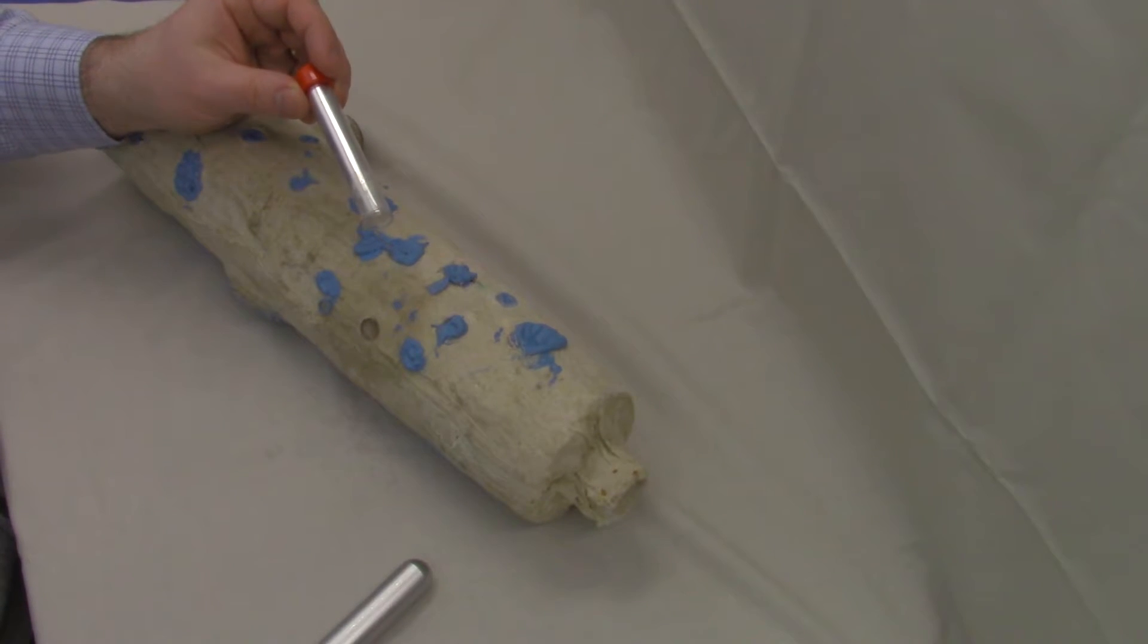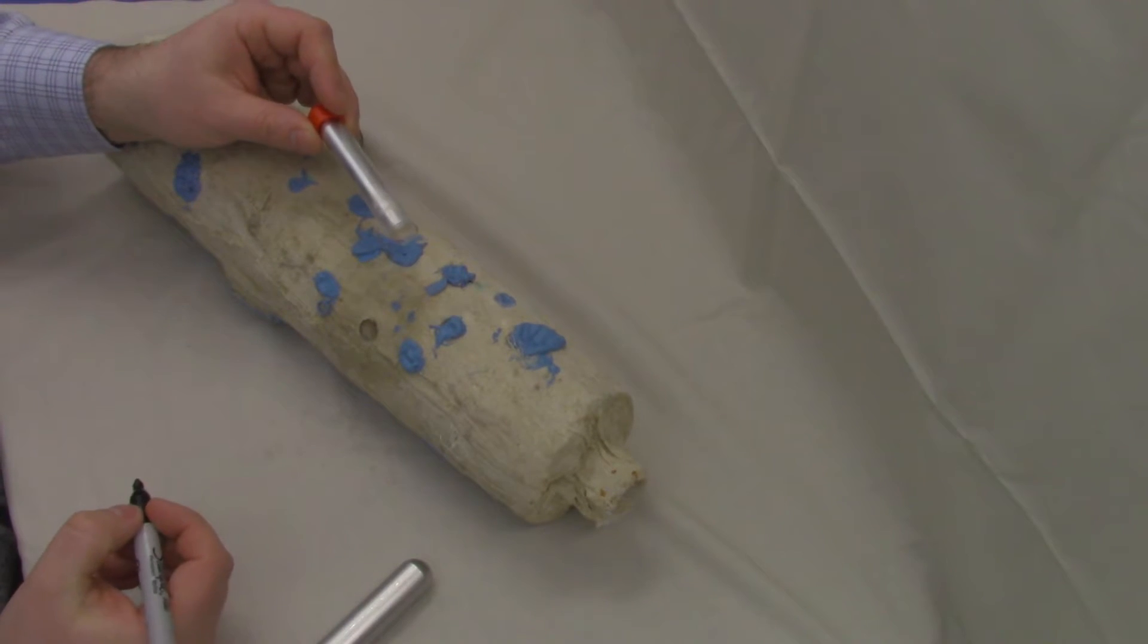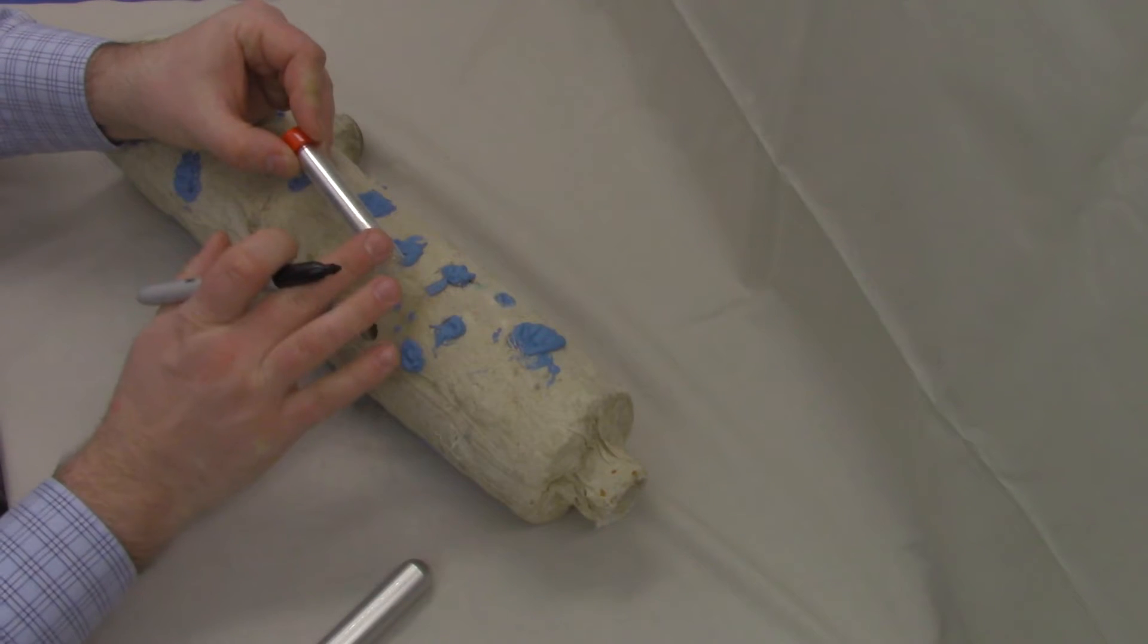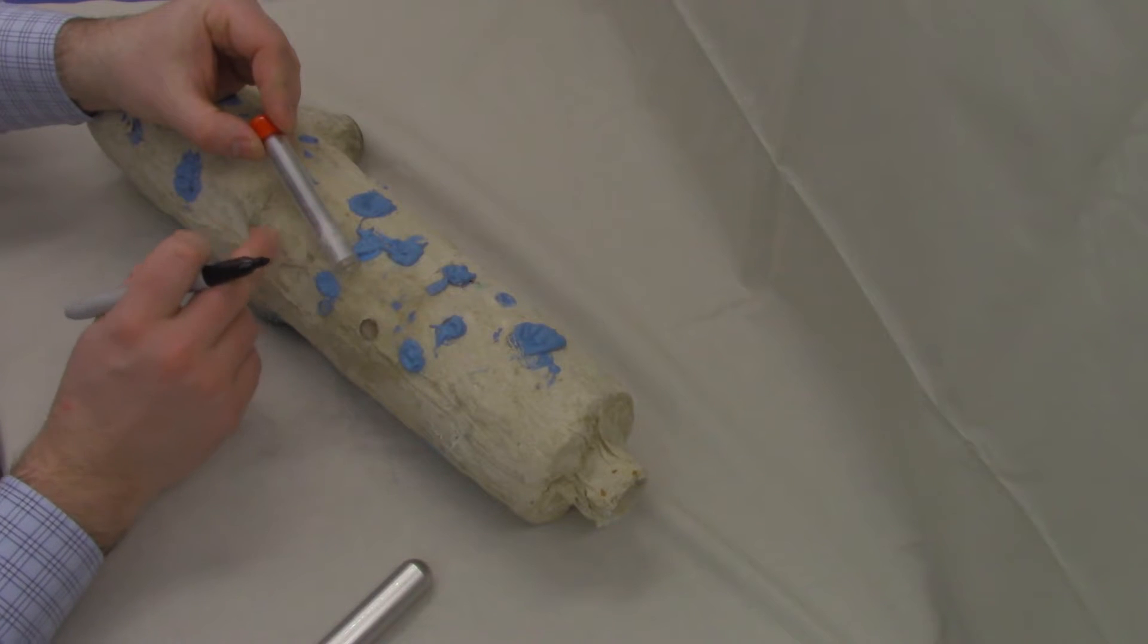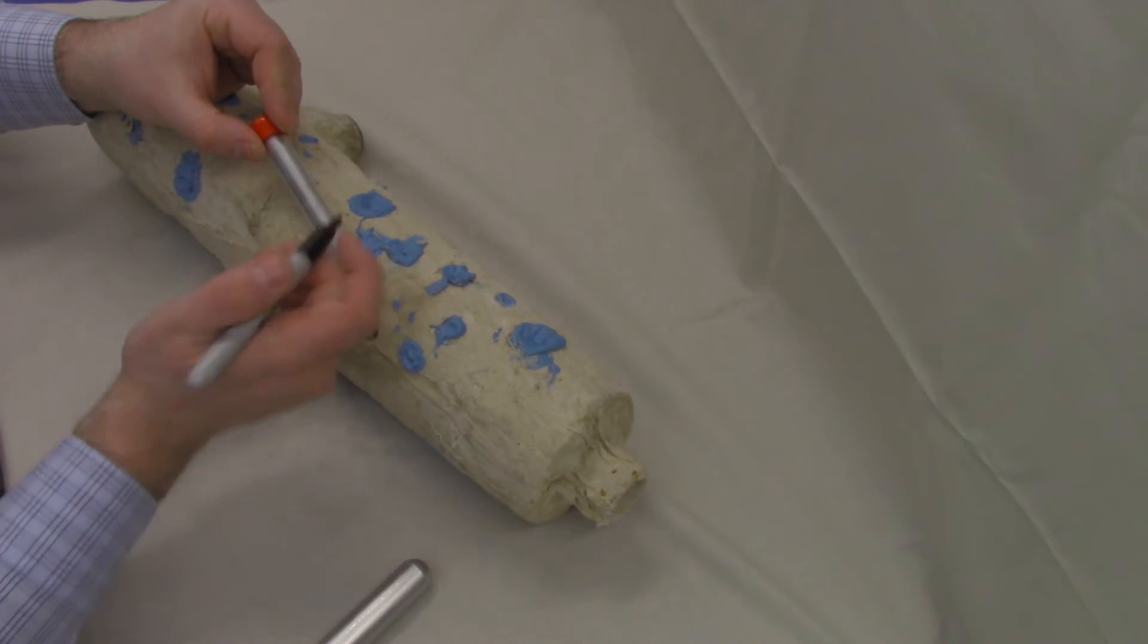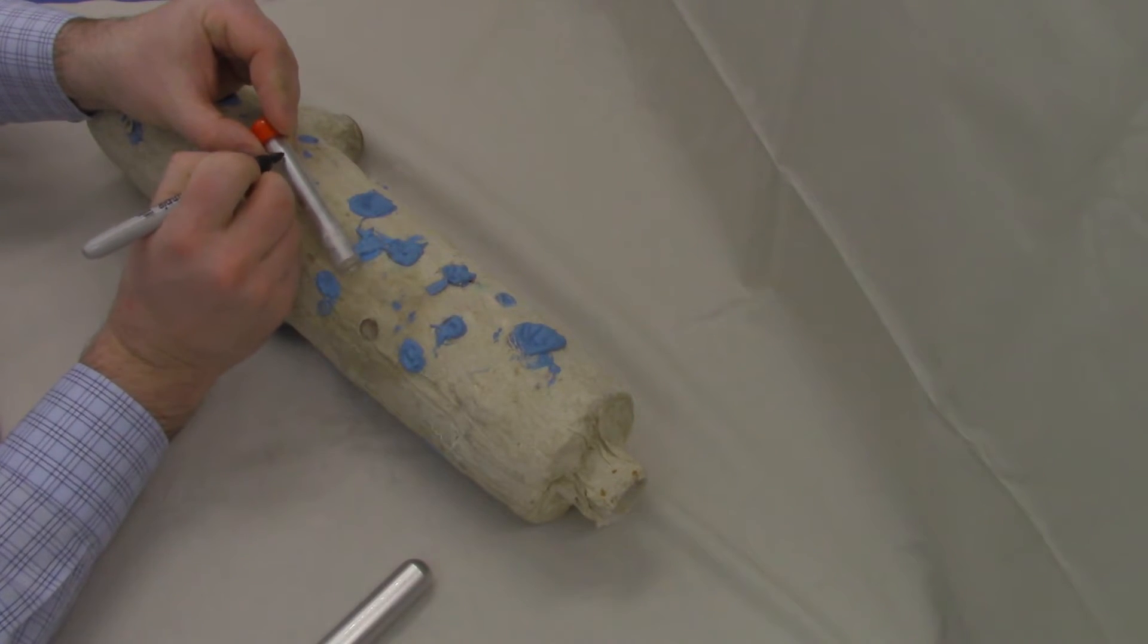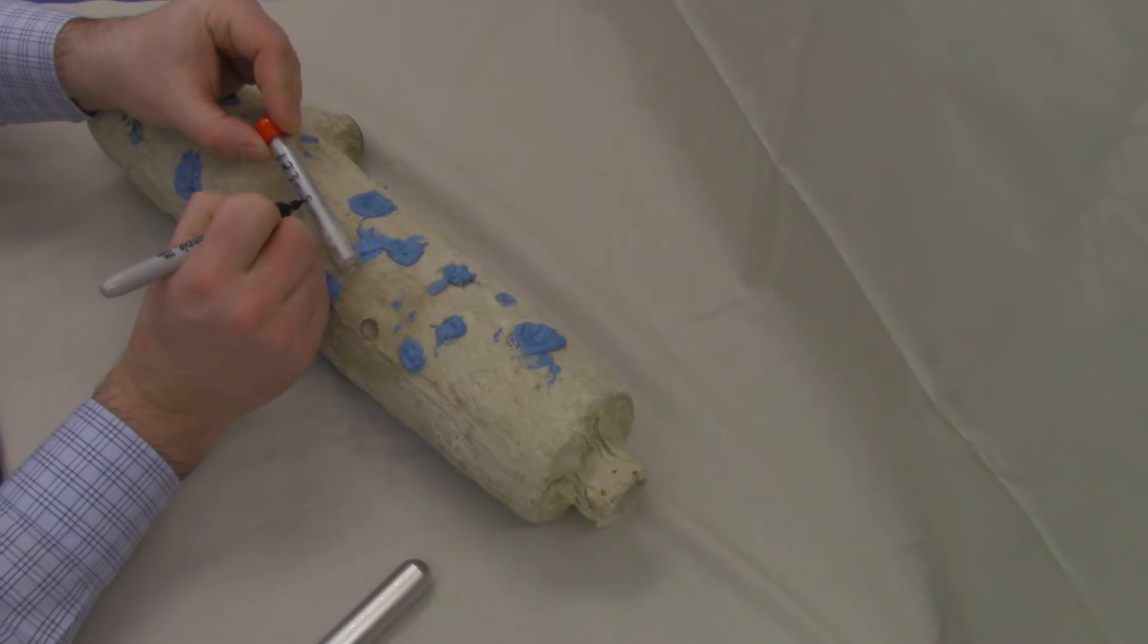In order to prevent your sample from getting confused with other samples on a different project or someone else's samples, you can write right on this tube. We typically do that with a Sharpie. We've also heard of people using a label maker to create their labels and then you just apply the sticker. In this case, I'm going to label it 123 Smith.